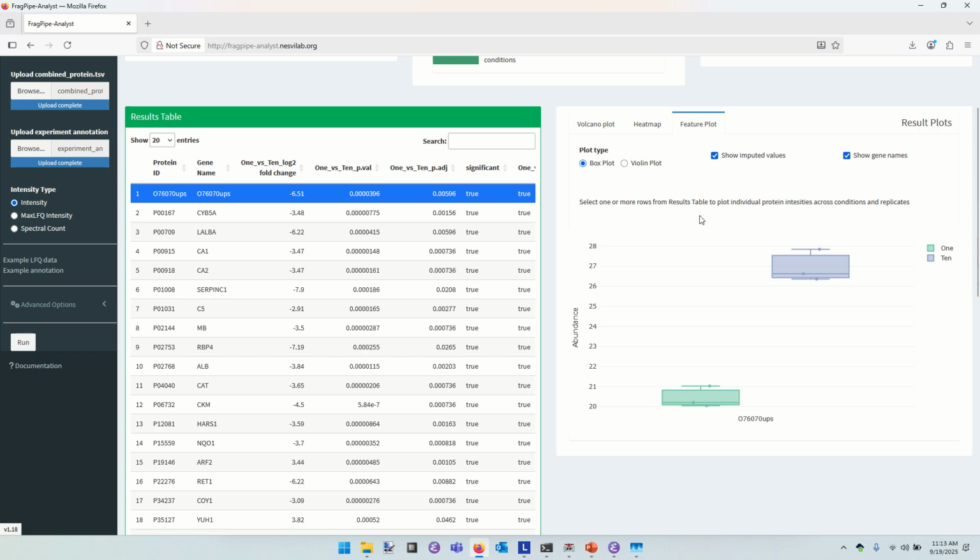Okay, now when the software came up with a p-value for this comparison, it had to do something about the zeros that were reported. And so we see that these are the 3 values that were used for it, and they're all positive at least, so it's now got some sort of imputed value over here. That's where it came up with its negative 6.5 log 2 fold change. But it's useful to be able to show real data versus imputed data for a protein, because when you have a really extreme p-value, it's very likely the case that at least some of the points on one of the cohorts is imputed. Yeah, for the imputation, what would be the best way to do it?